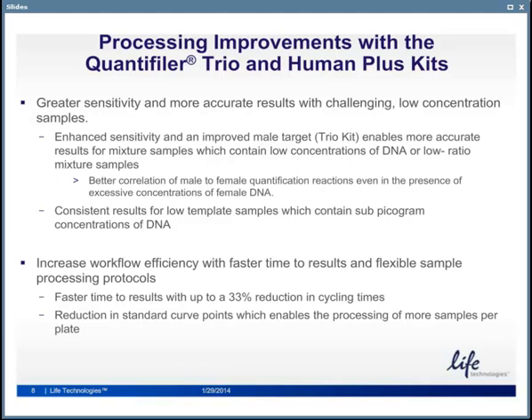And finally, we've improved the workflow efficiency. Now the PCR cycling time has been reduced to about an hour, and we've reduced the number of standard curve points. Previously, we had 8 standard curve points, and now we have 5 to 6 data points.